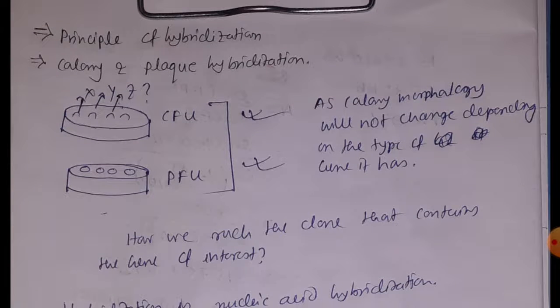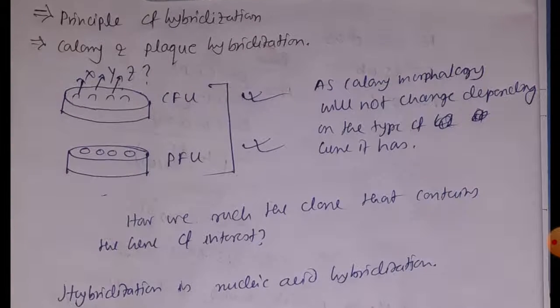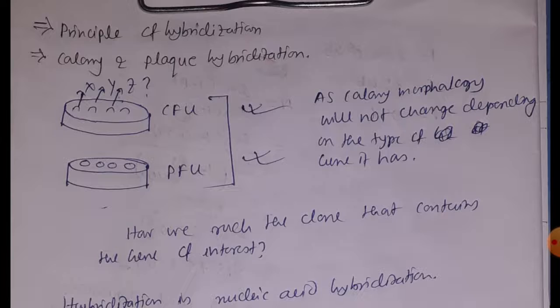In our previous video we discussed the genomic DNA library, and in that video I told you why you should form a library. If you think about it normally, we form a library so that we can get our desired book whenever we require it. Similarly, a genomic DNA library is formed for that same purpose, that means it is formed to find our gene of interest, which we want to study, whenever required.